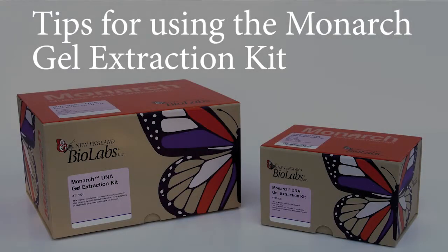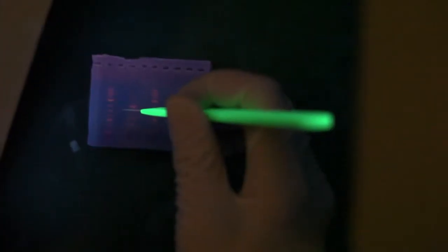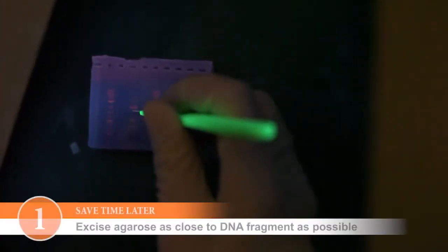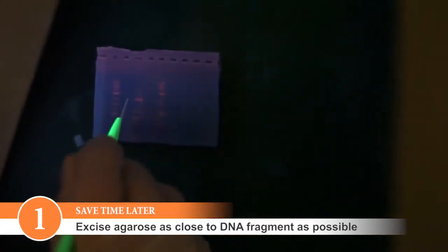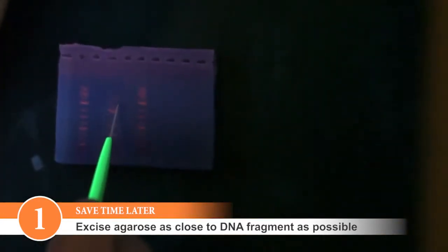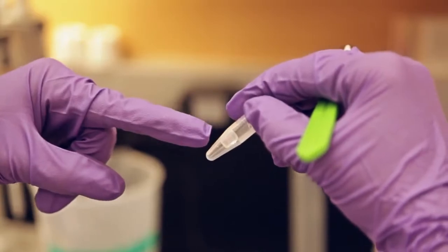Here are some tips for optimization when using the Monarch Gel Extraction Kit. For increased efficiency, try to excise the agarose as close to the DNA fragment as possible. Excess agarose will result in higher volume samples, which may require more than one centrifugation step in order to load the sample onto the column.